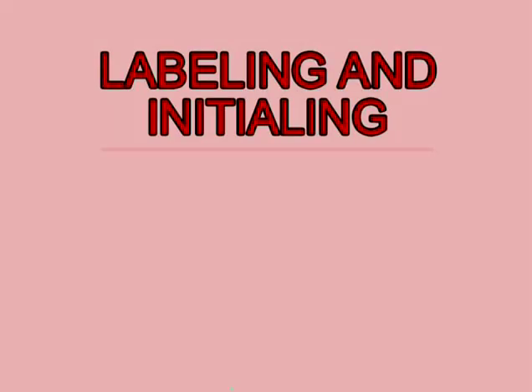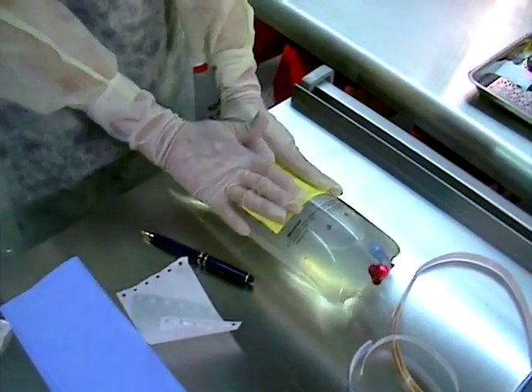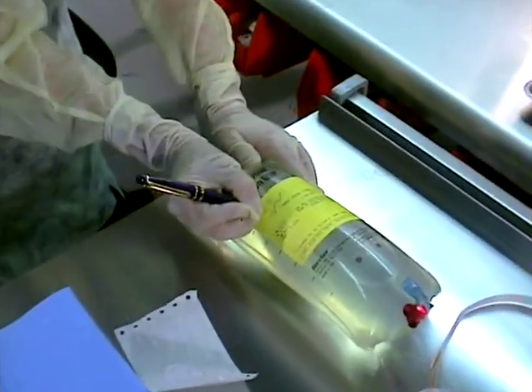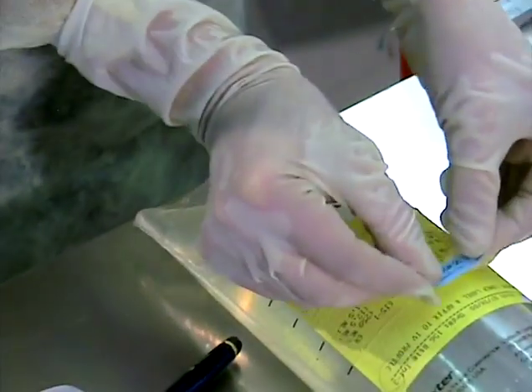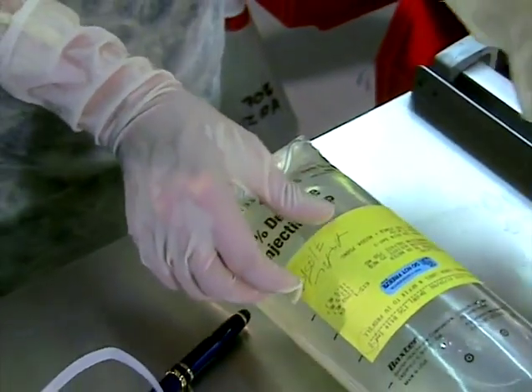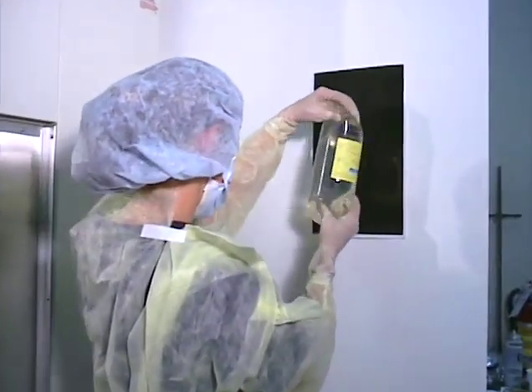Labeling and initialing. Upon completion of compounding, all labels should be applied and initialed by the operator. The date of compounding as well as the solution expiration date should be noted. Any auxiliary labels, such as do not refrigerate, and chemotherapeutic agent warning labels should be attached. The final containers should be visually checked for particulates against both a white and black background.